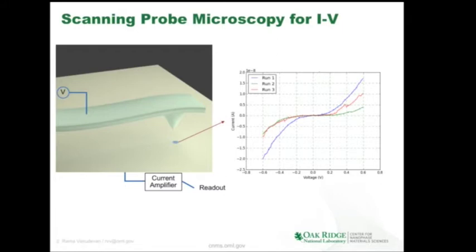So what I've plotted here is an IV curve, or three IV curves, I should say, from an oxide sample captured using an atomic force microscope. I basically just varied the voltage from minus 0.6 volts through to 0.6 volts in this case, and I captured three different IV curves across the surface of the sample.